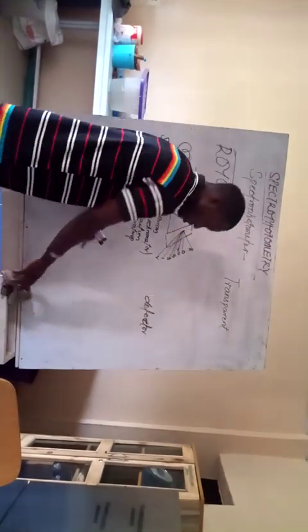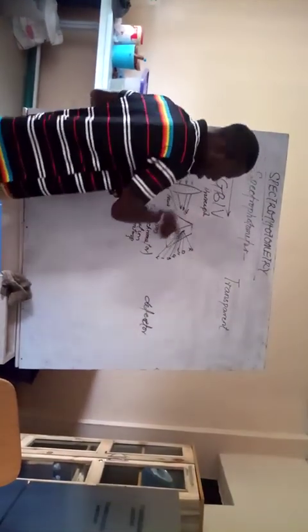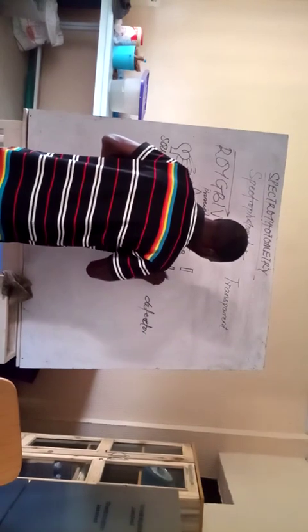All of these colors we wrote here are basically wavelengths of light. It is rotated so that only a particular wavelength of light can pass through a component called the exit slit.